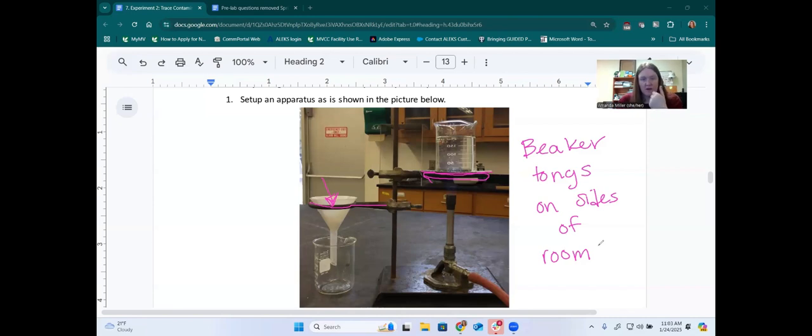But they have rubber on them, which makes it ideal for gripping. So you get these sort of rubber curved pinchers, and then the handles come out the other way. So they kind of look something like that. I'll show them to you in lab. You can grab beaker tongs whenever you need them during lab.